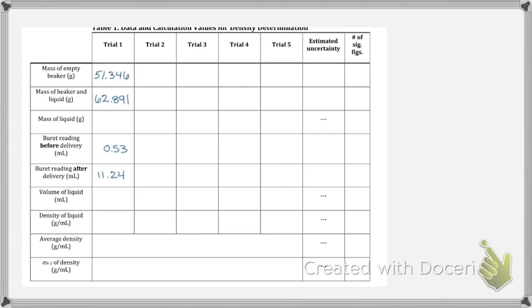So now I'm going to give you the masses of the other 4 beakers. You weigh 4 other empty beakers and you get 48.617, 49.158, 55.636, and 52.125. Then you go ahead and you start filling up the beakers.